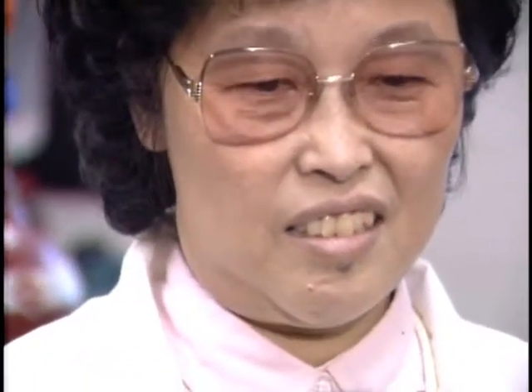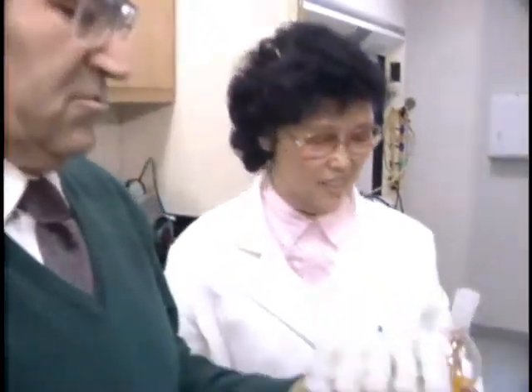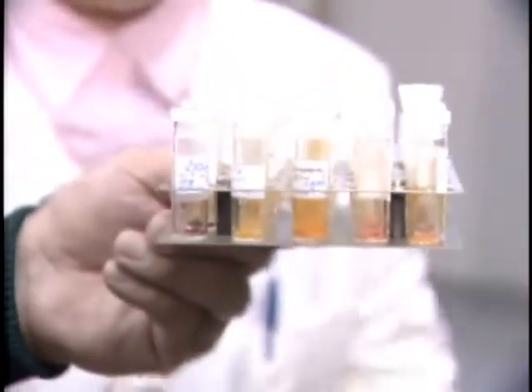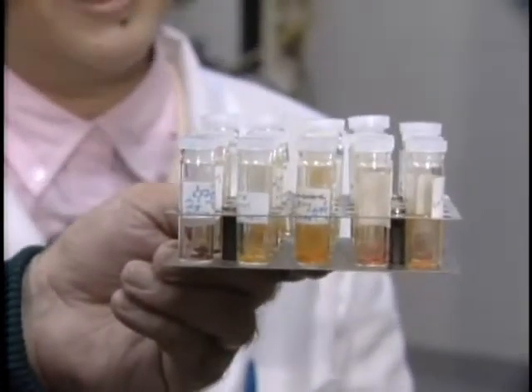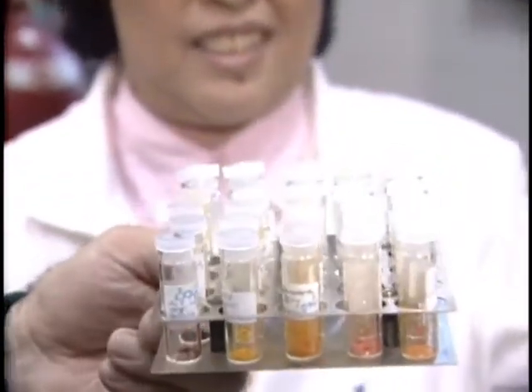So all these compounds, how many of these samples have we sent to Eli Lilly? We have sent about 28 compounds, totally 28. Right now we are waiting for the results to come from Eli Lilly, from Dr. Merriman's. That's good. This is the compound product, the byproduct. Oh, that's very good. These are very good, and it seems that they are very pure crystals. Spectrum identification, very good.